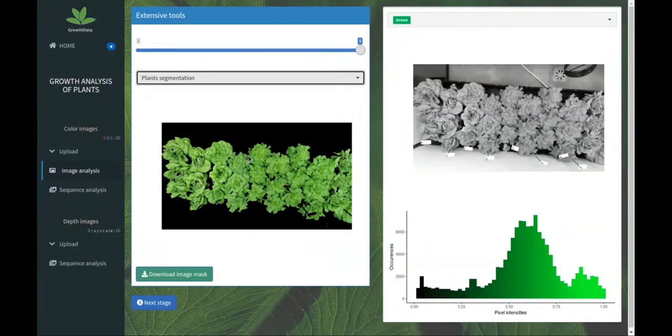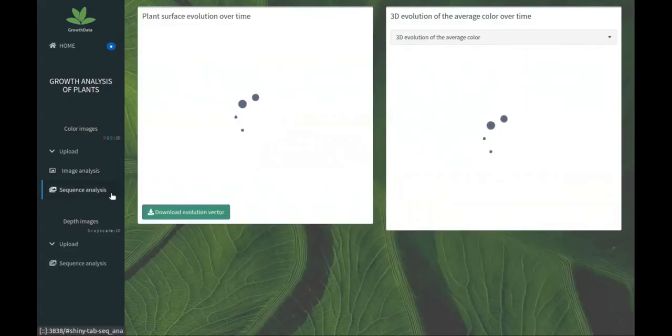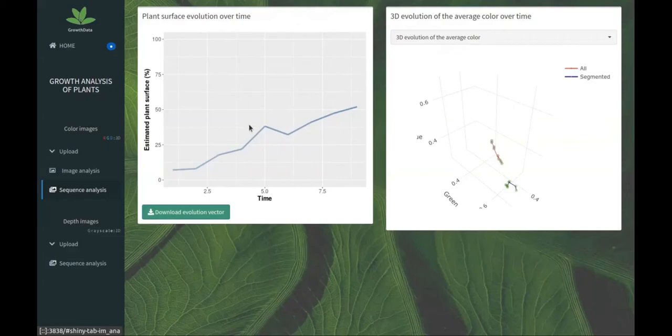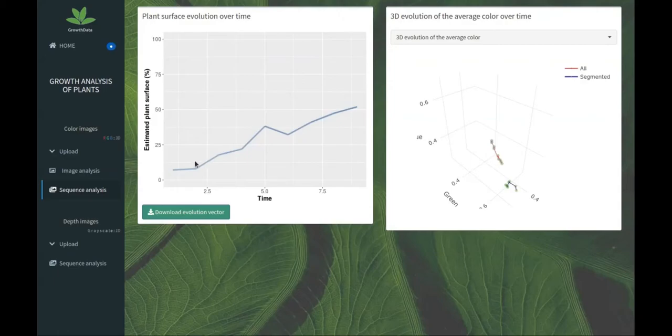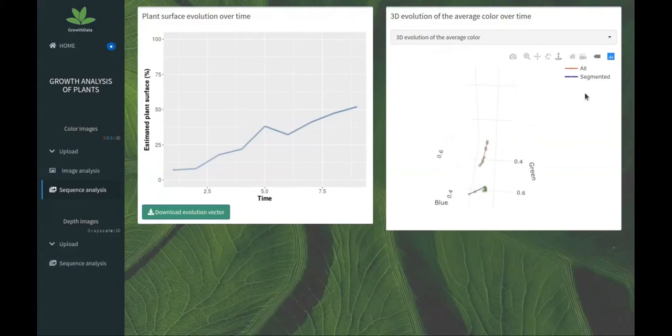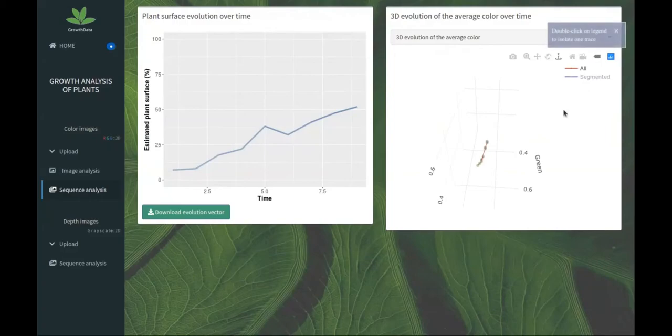We also have the tool which allows you to segment the salad from the background. With that segmentation, we can compute and estimate the plant surface over time. We do that segmentation for each time, for each image. After that, we have the number of pixels which cover the image.